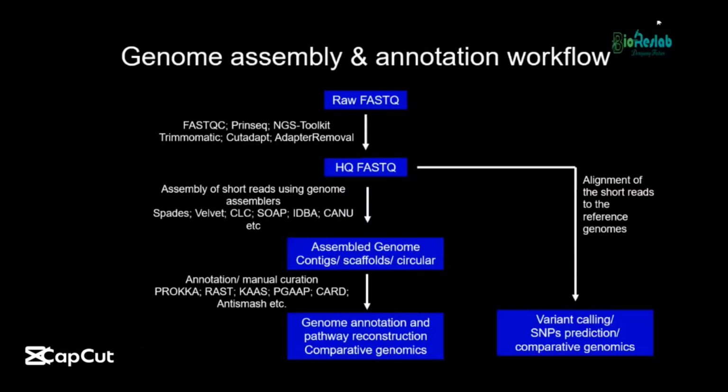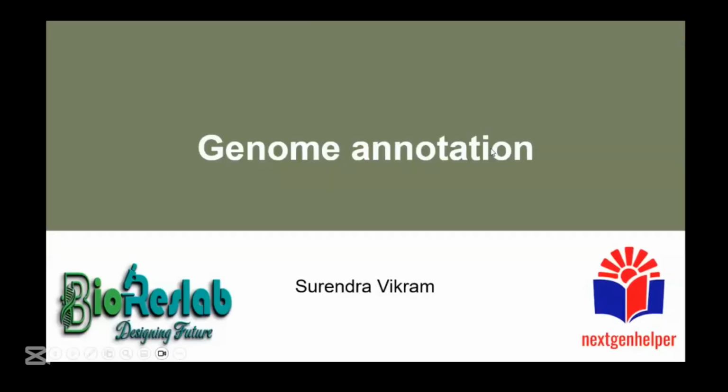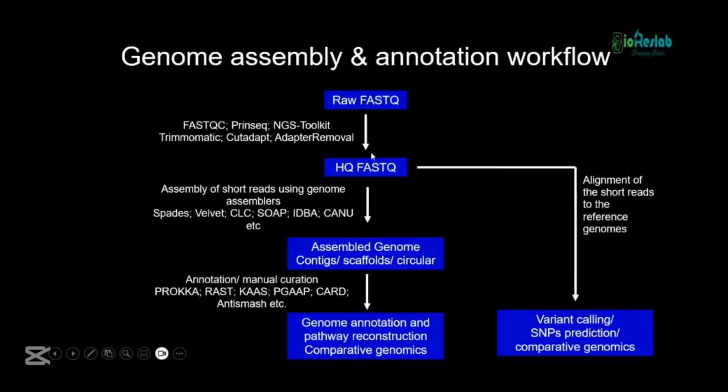So we have done yesterday till this step. We had the raw FASTQ sequences, from which we received HQ FASTQ by using different tools. Then we assembled the genome into the draft genome yesterday. From there we can do the genome annotation.